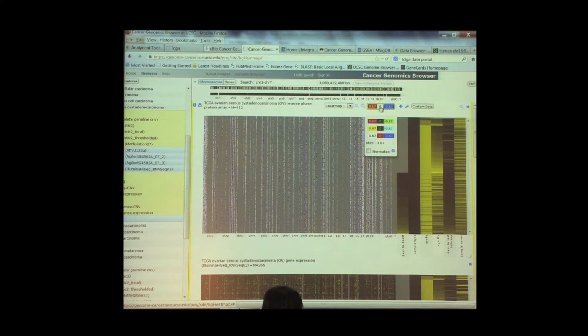So if you're not colorblind, you can do red-green. If you dislike looking at white, you can do yellow-teal or cyan. You can change this for however you want to visualize the data, and depending upon what you're looking at, you may find that you move from, say, heat map into proportions, and you're having a hard time seeing gradation, and it's easier to switch things over.